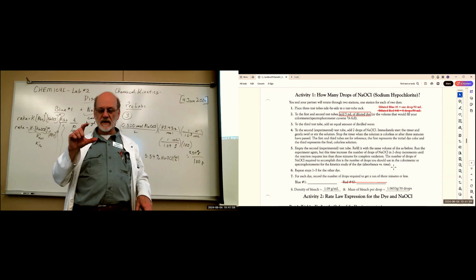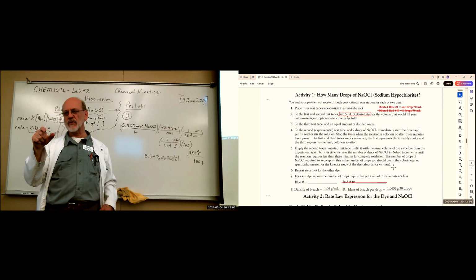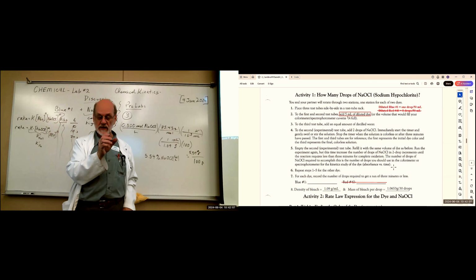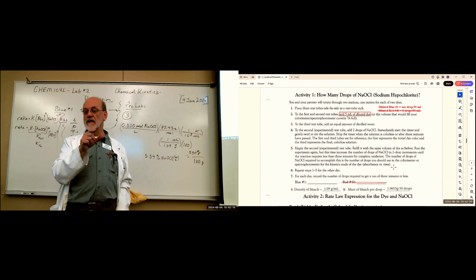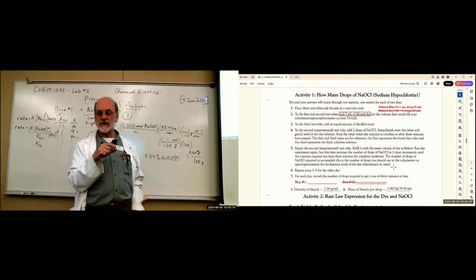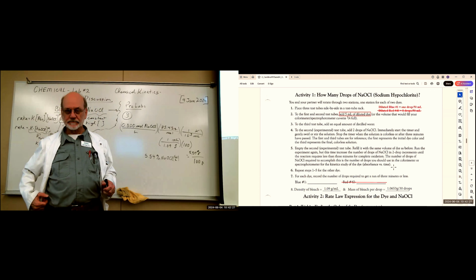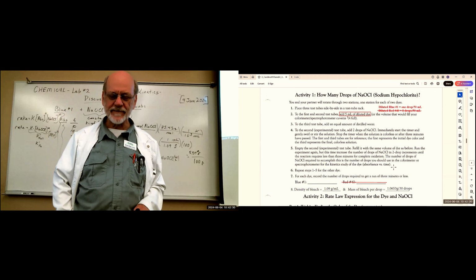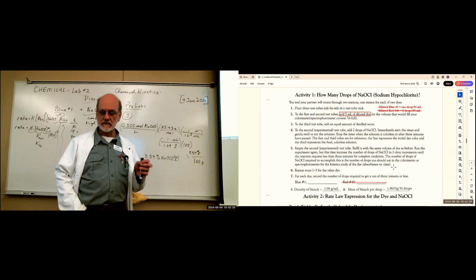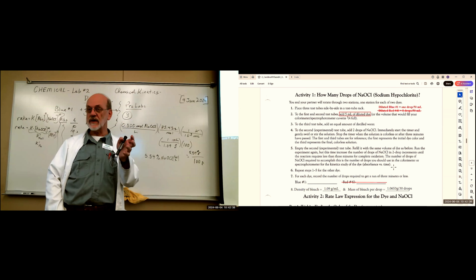The other problem is the little square cuvettes, actually polycarbonate cuvettes, that we use in the spectrophotometer. They are not 5 mils. The maximum they will hold is 3 mils. So once you find out how many drops per 5 mils, you need to prorate it for 3 mils, like 3/5 of the drops. Then deliver 3 mils of your colored solution into the cuvette.